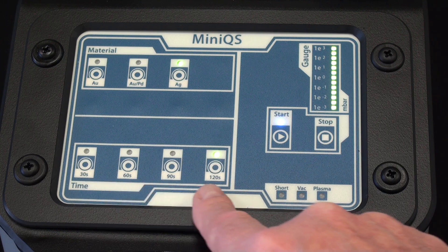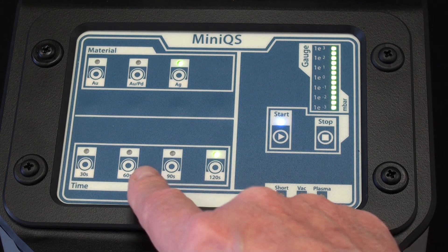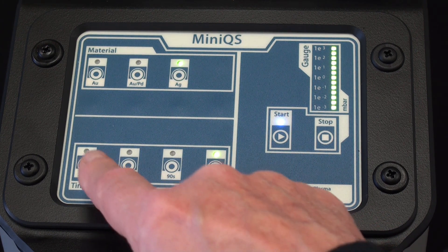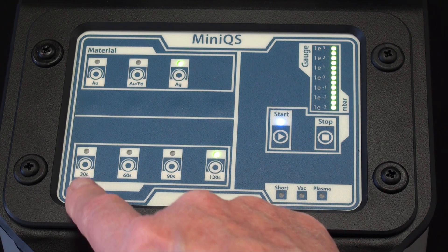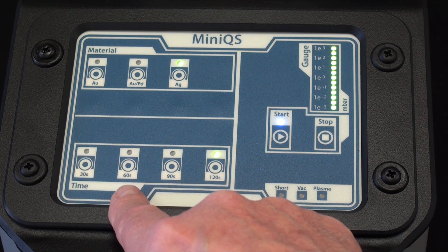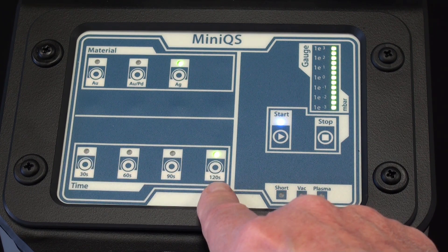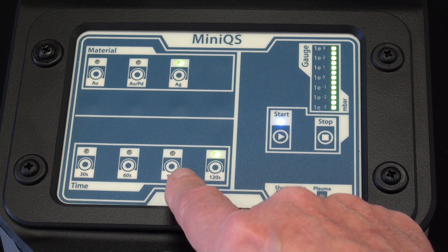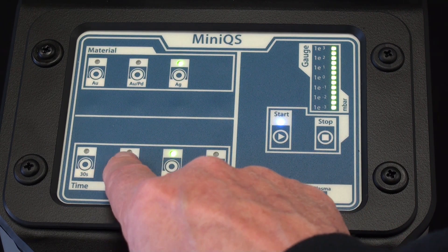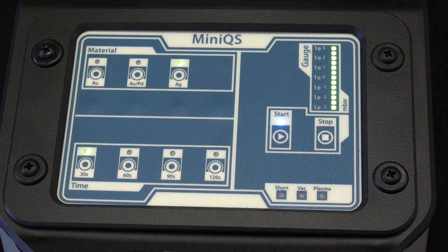Down below here on the bottom row, we have the times that you can coat your sample. You have 30 seconds, 60 seconds, 90 seconds, and 120 seconds, and again that's easily switched by just touching the button.